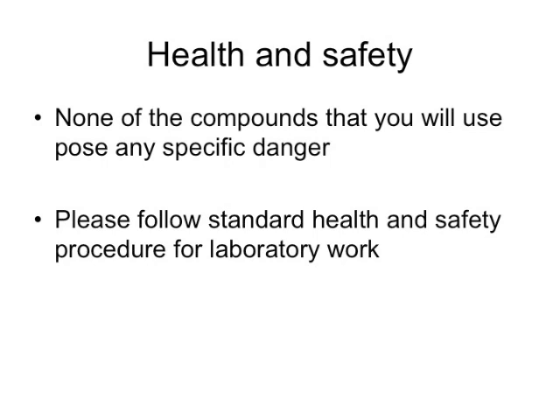This practical does not involve compounds which are particularly dangerous, but do follow standard procedure for safe work in the laboratory. Remember that you have to complete your quiz before you can come to the lab.